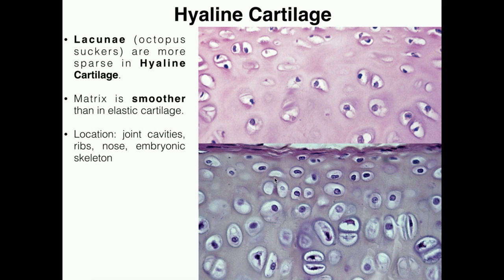In hyaline cartilage, we still have these octopus suckers — these lacunae — which you do need to be able to recognize. But notice that the matrix is a lot smoother. If you look outside of the lacunae, this looks like a much smoother matrix than it does in elastic cartilage. That's sort of the giveaway that it's hyaline cartilage. Also in hyaline cartilage, generally speaking, these lacunae are not as tightly packed together — they can be a little more sparse, but you should still easily be able to see them.